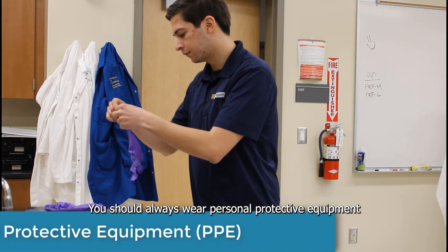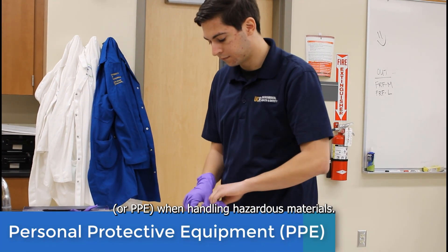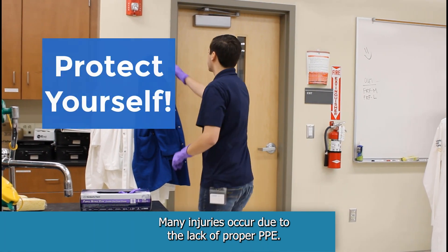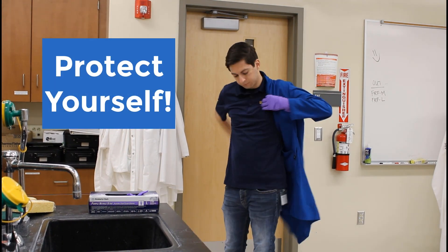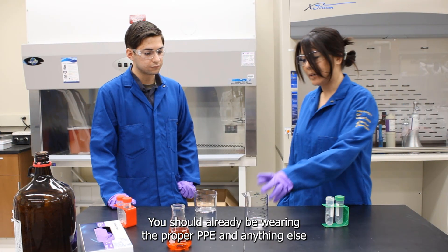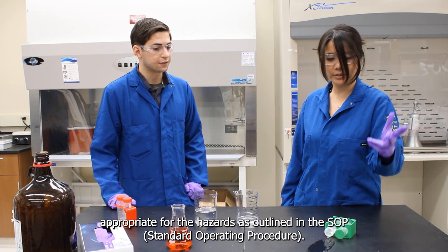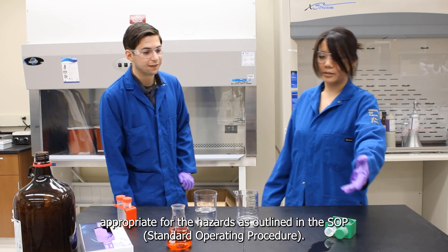You should always wear personal protective equipment or PPE when handling hazardous materials. Many injuries occur due to the lack of proper PPE, so be sure to protect yourself. If the spill occurs while you are working, you should already be wearing the proper PPE and anything else appropriate for the hazards as outlined in the SOP.